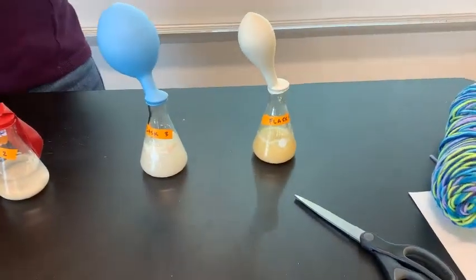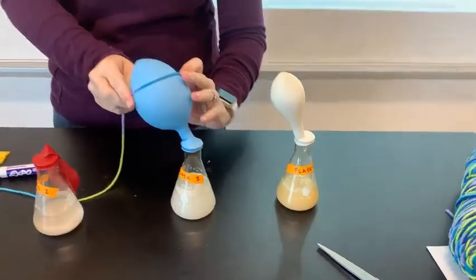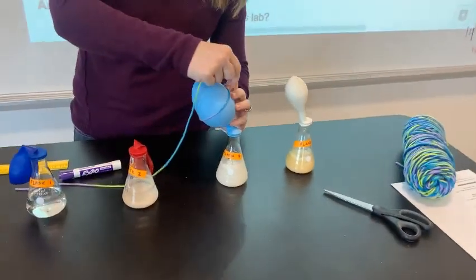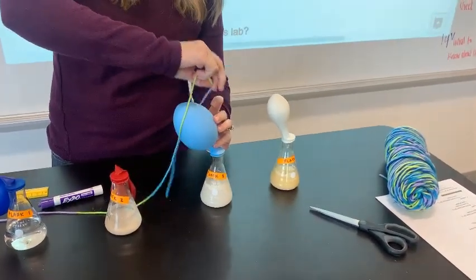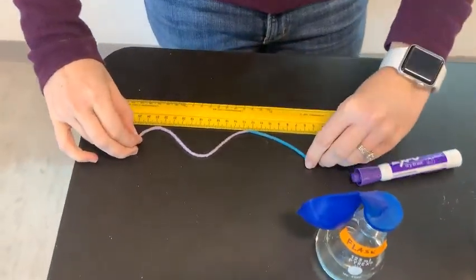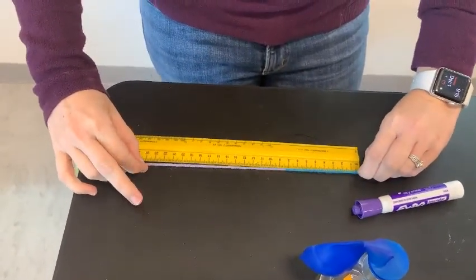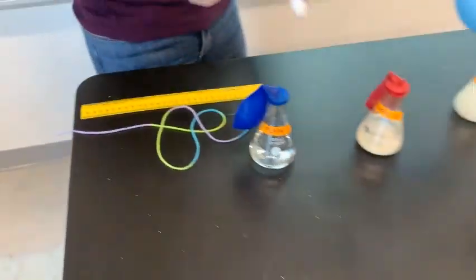We can see that flask three has a lot of gas produced. I'm going to try to find the widest part of the balloon — this isn't perfect science, it's really an estimate — but with this I get about 24.5 centimeters.